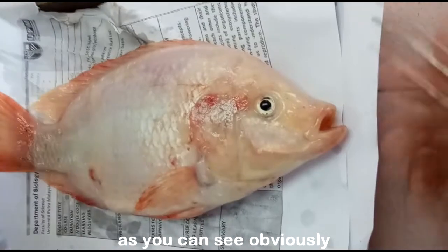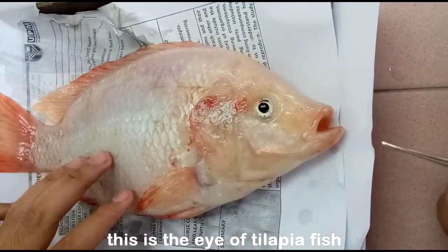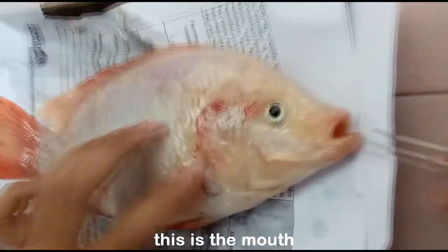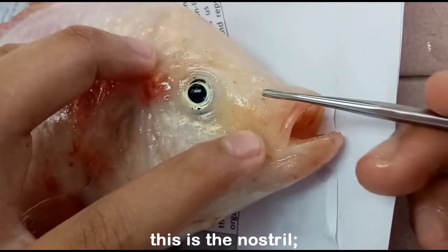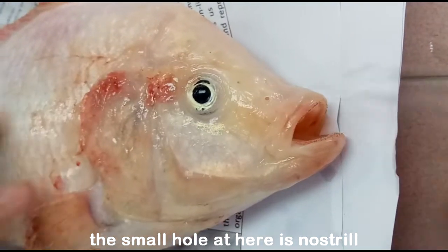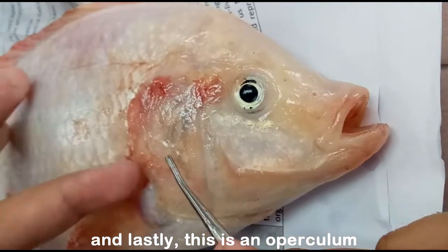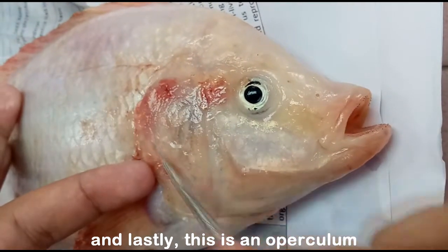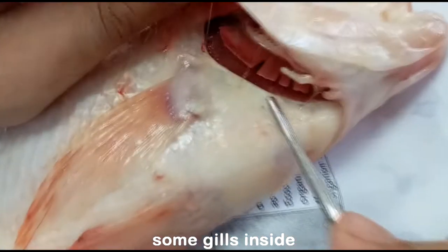As you can see, obviously the head consists of the eye. This is the eye of the tilapia fish. This is the mouth or the snout. This is the nostril. The small hole in here is the nostril. And lastly, this is the operculum. Not pectoral, it is the operculum. So the operculum consists of some gills inside.